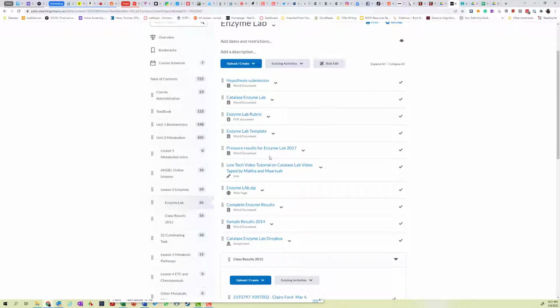I did vet it. I took a look at what everyone was doing in class, and it looked like you had good data. So hopefully everyone in the class gets their data up. Again, morning or afternoon data is perfectly fine. We're all one big giant class, so you can use whatever you'd like.